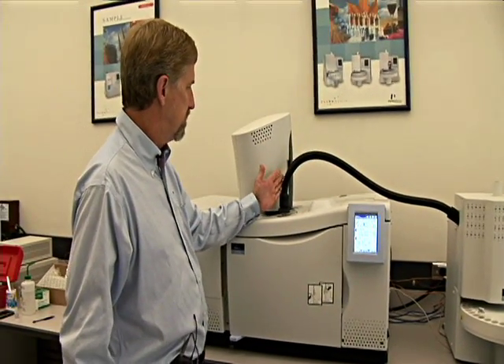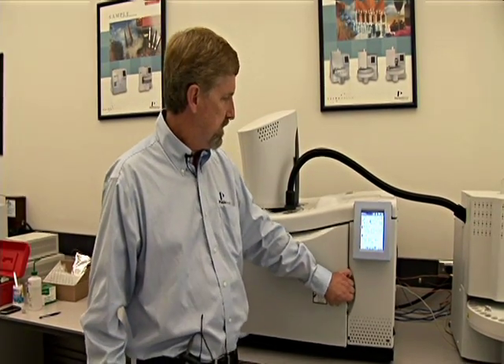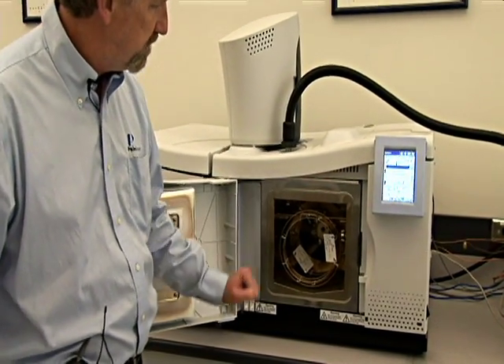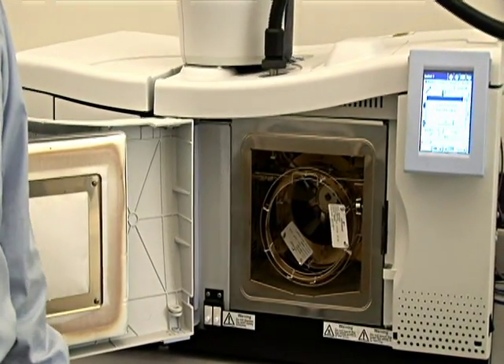They are both introduced into the GC through the injection port. On the inside of the GC, we have our GC columns. Here's where the separation chemistry occurs.